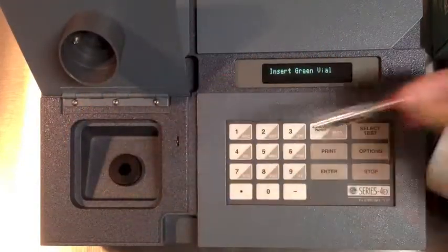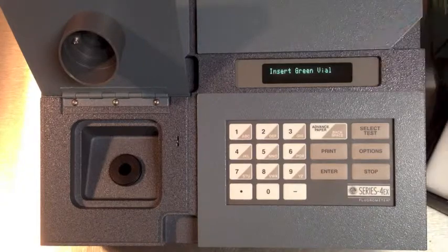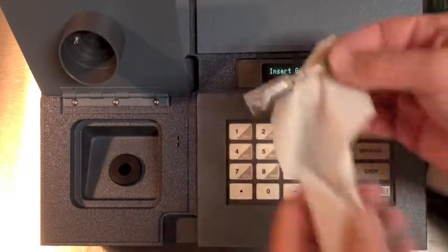The screen will then prompt you to remove the red vial and insert the green vial. Again, use the calibration settings from the current procedures manual and press Enter.